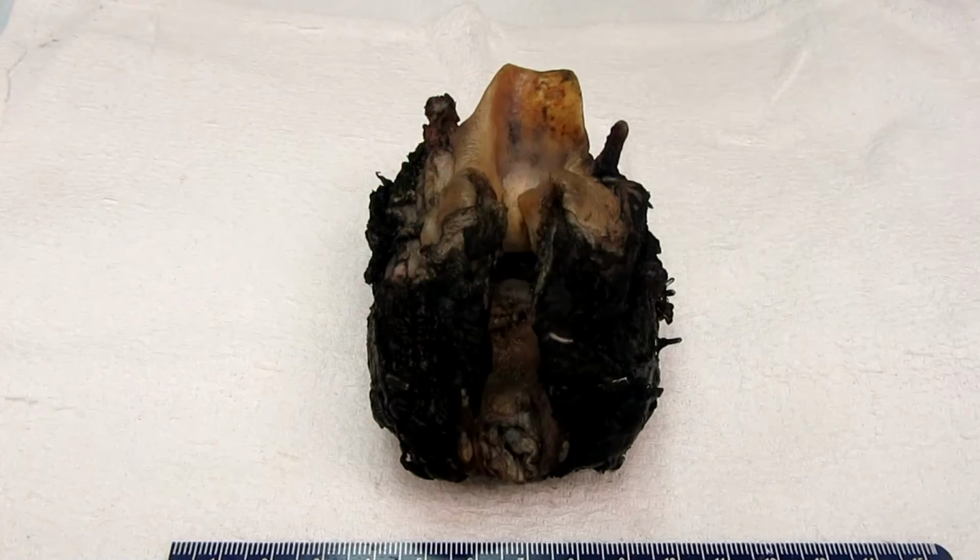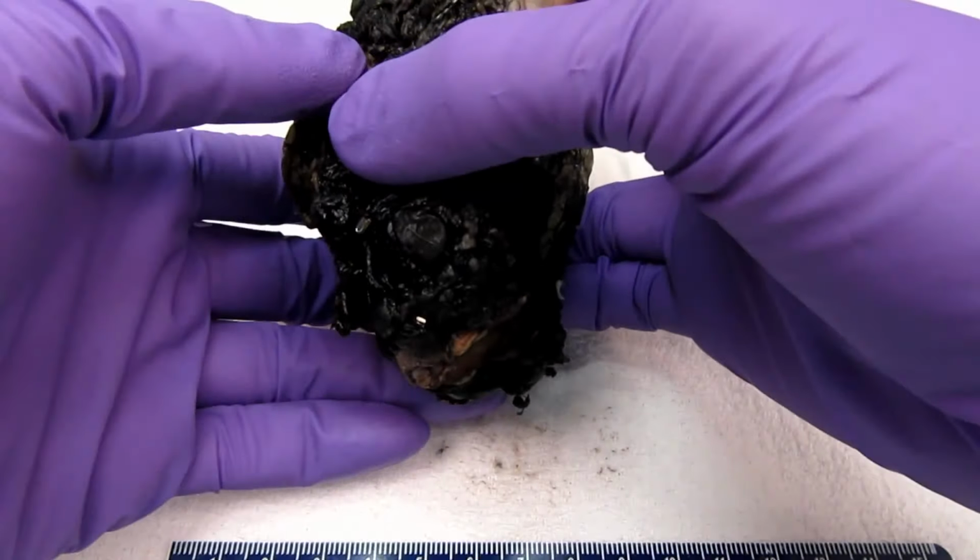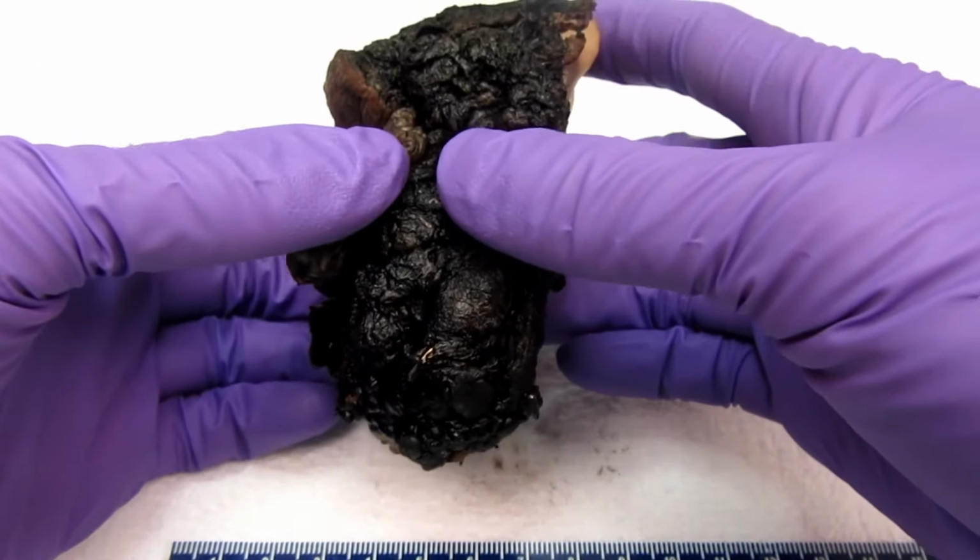This is a total laryngectomy specimen that was taken out for a necrotic lesion. The specimen has already been fixed with its margin inked black. We're just going to go over the general anatomy of the larynx and a few things that we need to consider for laryngeal cancer cases.